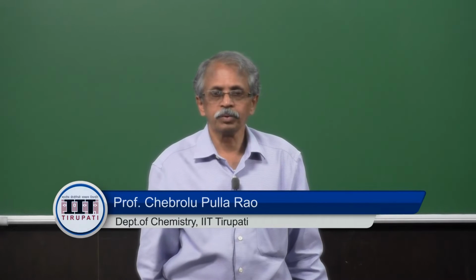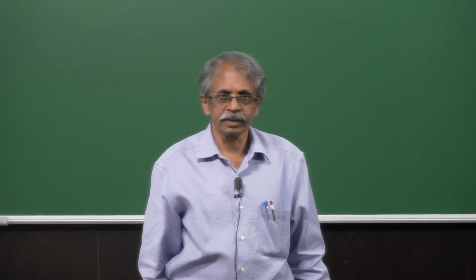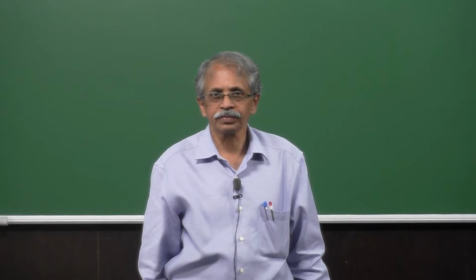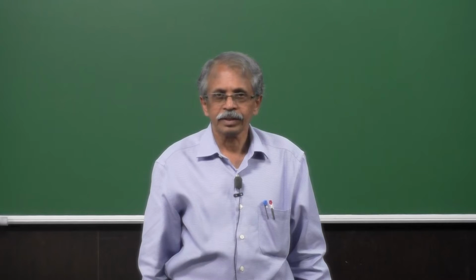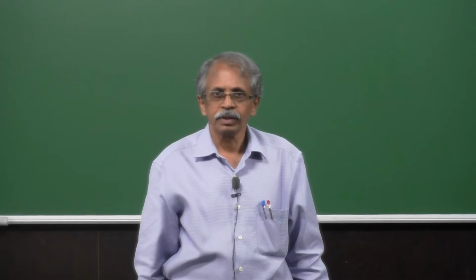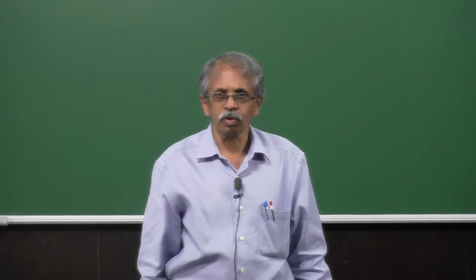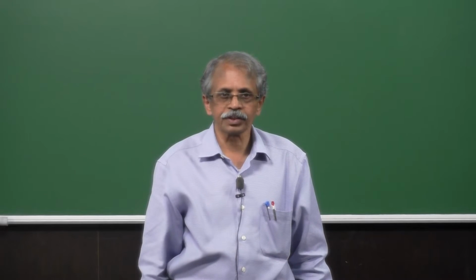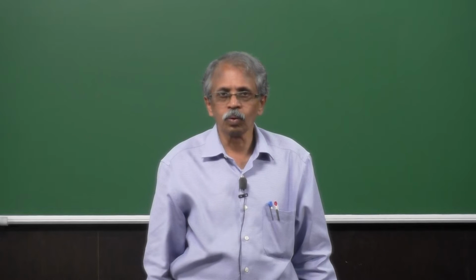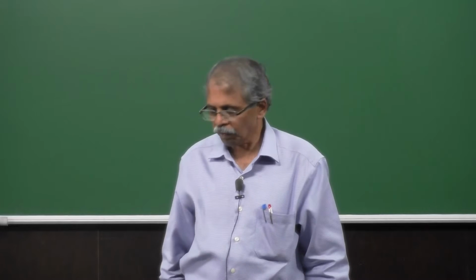Good morning, welcome you all to the next lecture in this particular course on analytical, spectral and microscopy studies of inorganic compounds and nanomaterials. In the previous class, we have been looking at the ESR, EPR related aspects. We already prepared a base for that, all the details corresponding. Now, we will look at how to understand a spectrum, what kind of signatures are seen in the spectrum. Then, once we finish that, we will go into a lot of application orientations of all that.